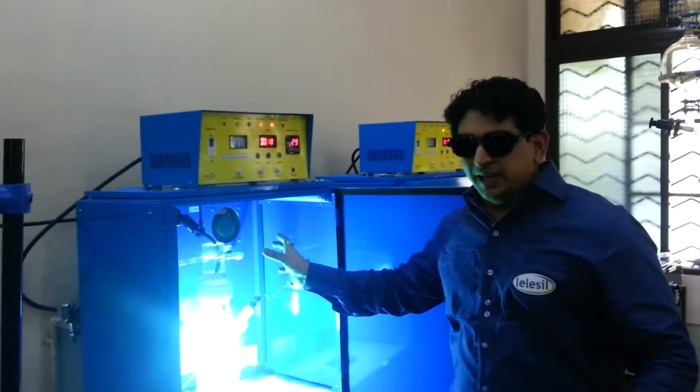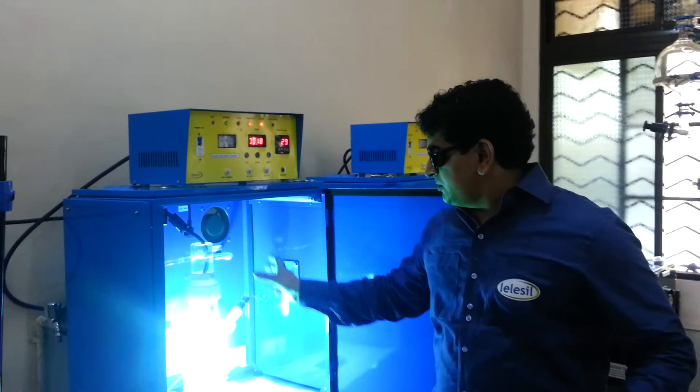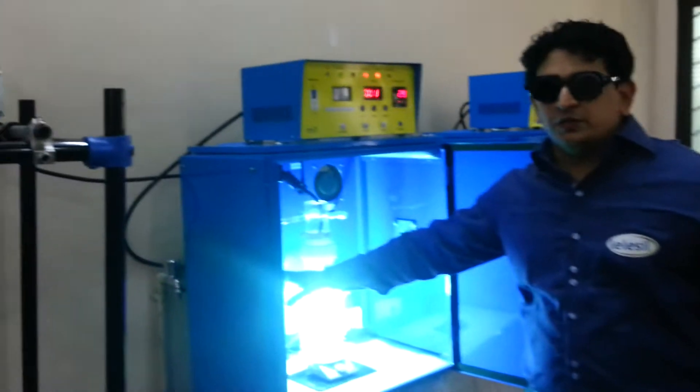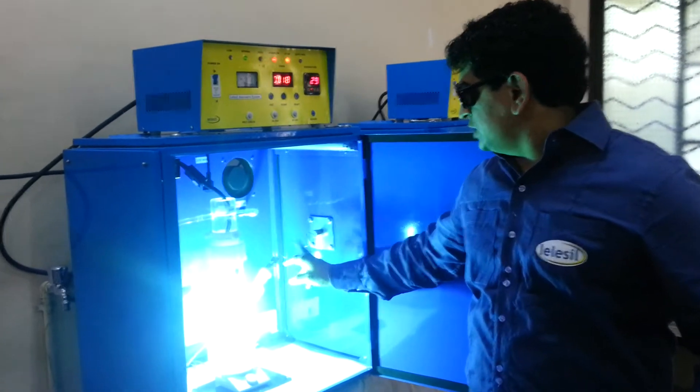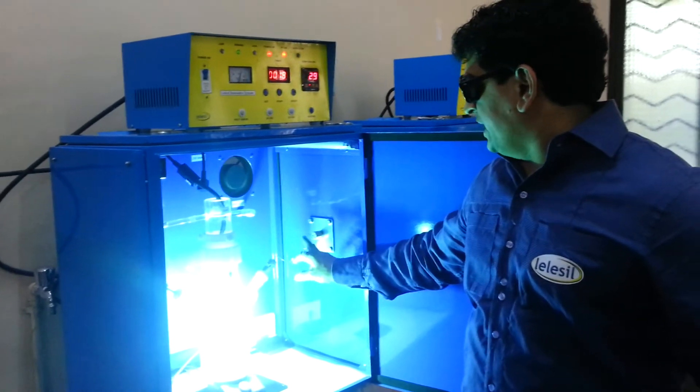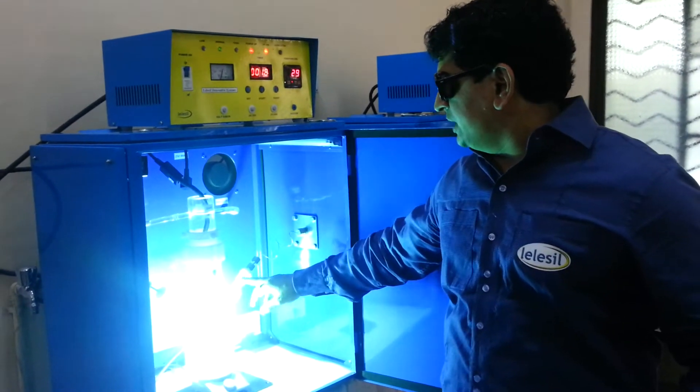What you see here is a reactor having 3 ports. One is for temperature, the other port is for material addition, and this is a special port which is developed by LSE for hydrogen gas, having connectivity between glass, Teflon, and stainless steel.